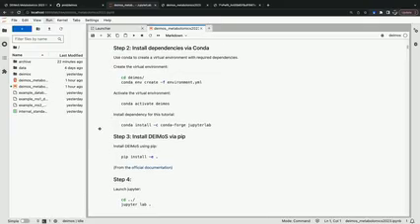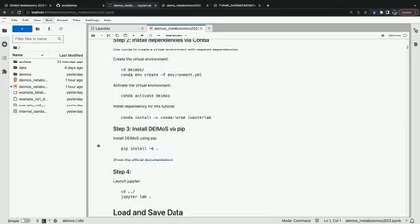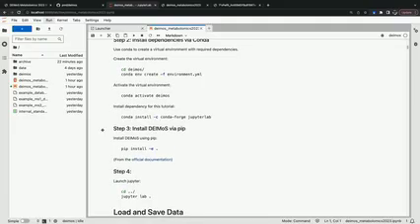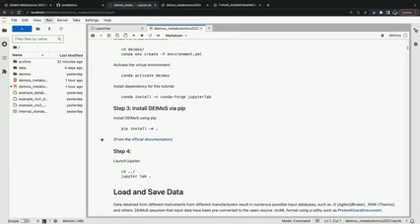And from there, specifically for this tutorial, if you don't already have Jupyter, we've included that here as part of the instructions. And then once you have all the dependencies downloaded, you can then install DEIMoS via the GitHub repository, which presumably you've already cloned via GitHub from the instructions as well. And the official documentation does go into a little bit more detail on the installation if there are further questions. We've simplified the instructions for the purpose of the workshop.